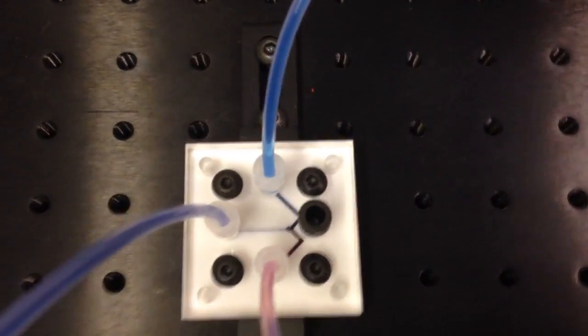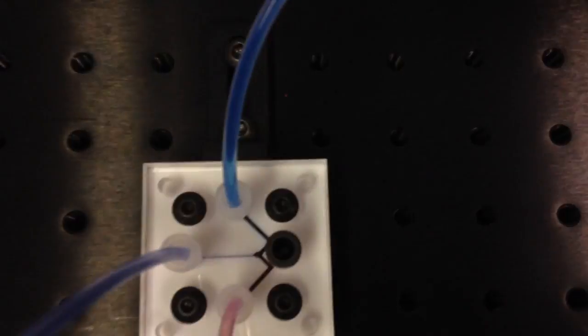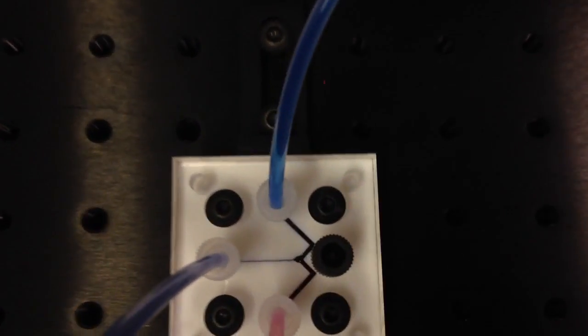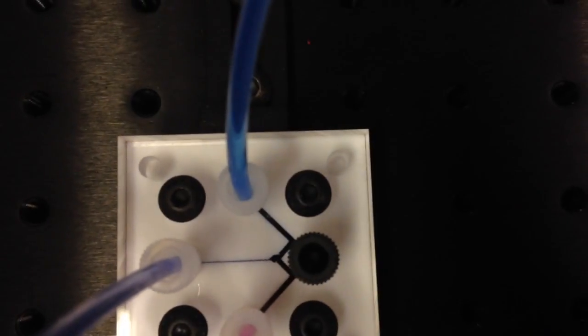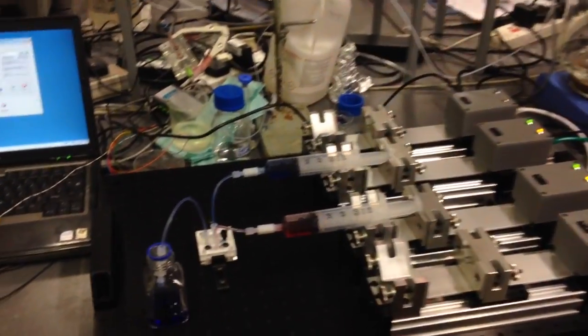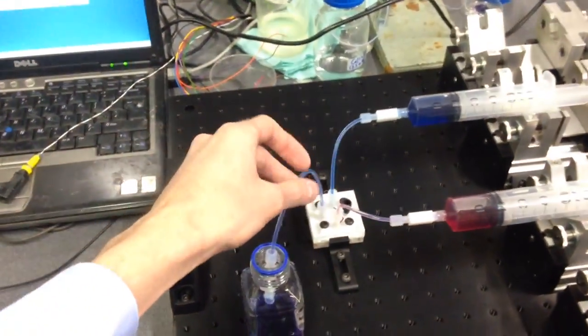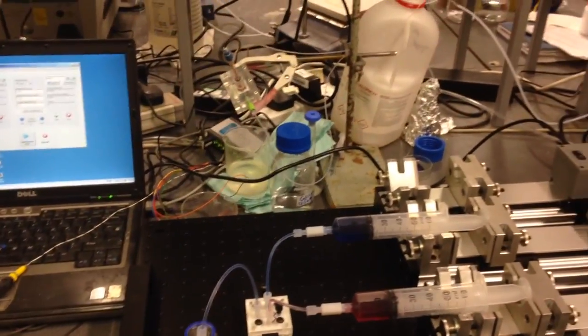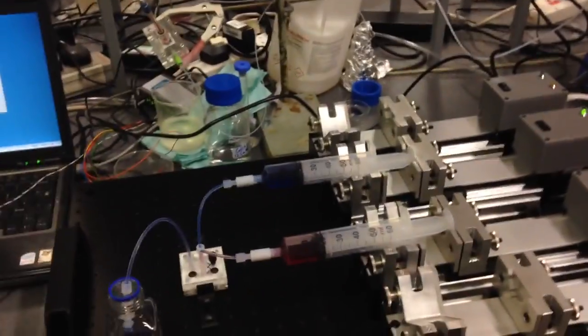This is the mixing channel that Akyla designed. Next step is to connect this tubing into the flow cell here and run some measurements with nanoparticles.